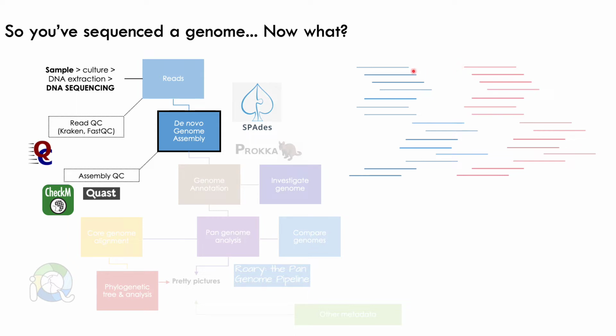So we can see that there's light and dark shaded reads, and I've done this on purpose. So if we take our light shaded reads to begin with, we just separate them out. If we essentially align them all together, I'm missing some complicated maths, but I just want to show you a schematic way of what this is actually doing.